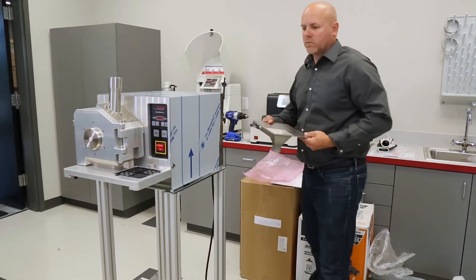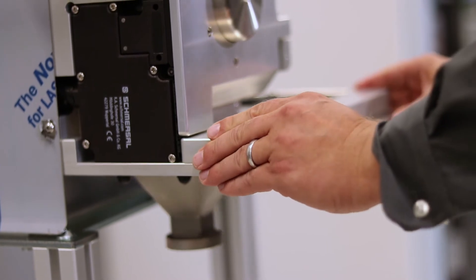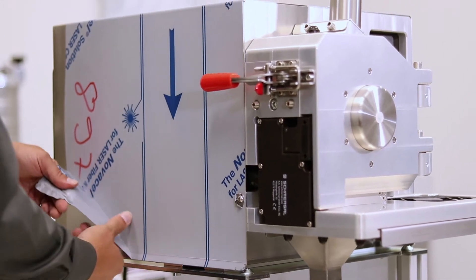Insert the cyclone adapter into the outlet slot of the P19 mill. Please note that as a safety feature, the P19 mill will not operate unless the cyclone adapter is fully inserted and the main door is fully closed and latched. Remove the protective plastic film from the housing of the mill.